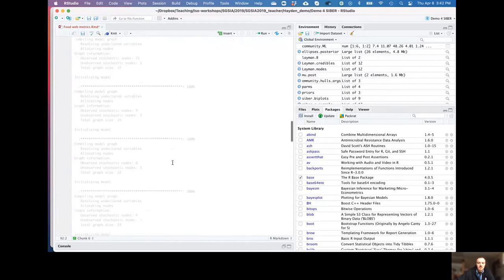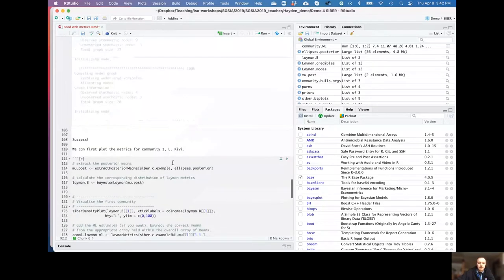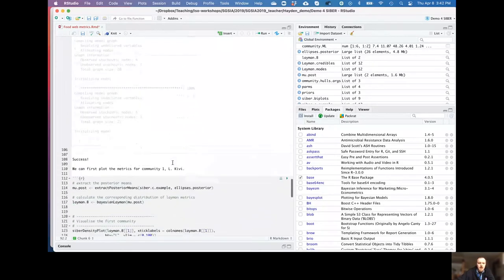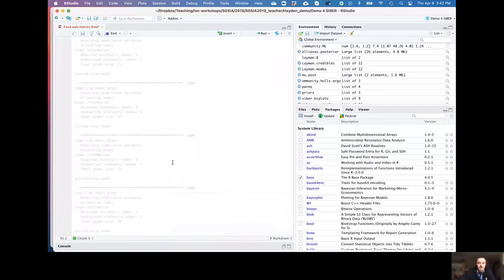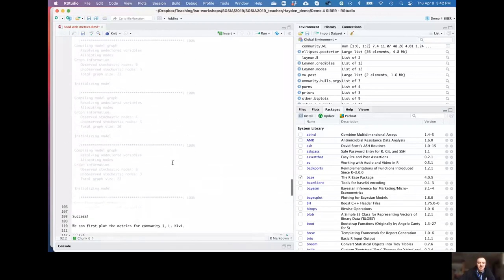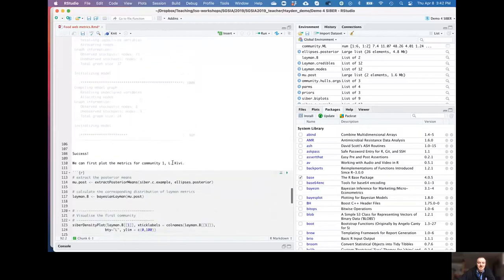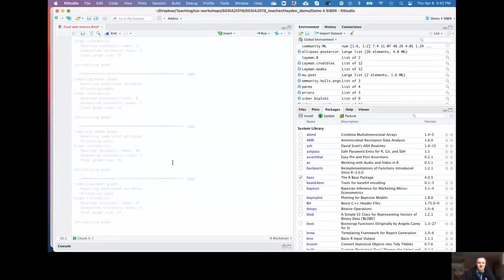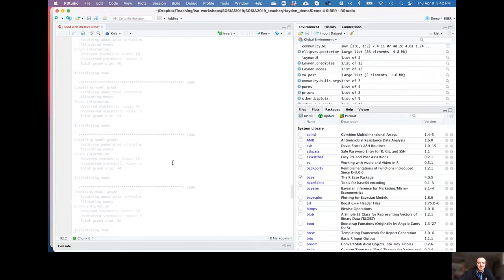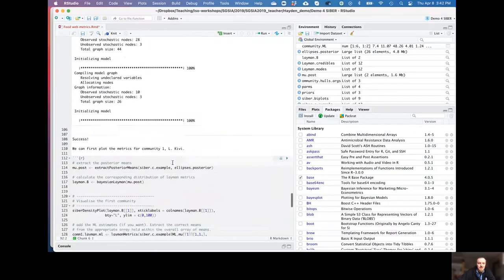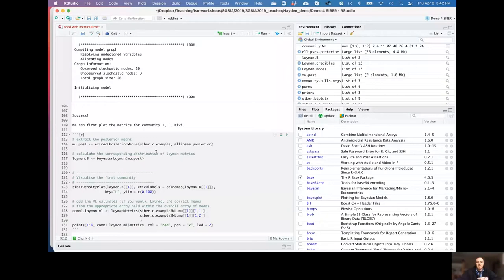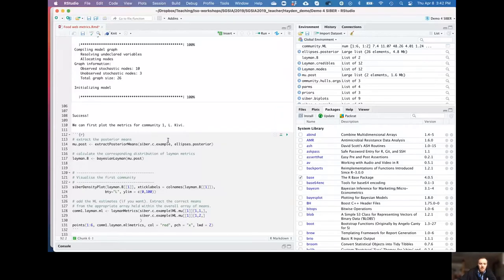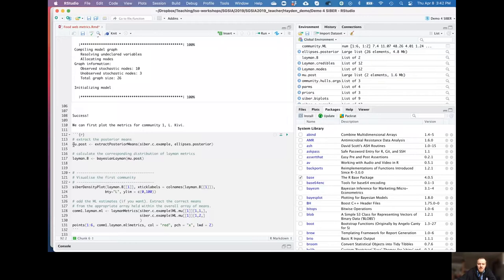It's going to take a bit longer than it did for the niche width, but not terribly long, hopefully. Okay, well that's churning away. We're going to scroll down to the next little piece down here. Won't take long, honestly. There we go. Told you it wouldn't take long. Okay, no warning messages, no complaints, no problems. So we're good to go. So we've now created a new object called SIAR example ellipses posterior and we want to start extracting some of the information from this.